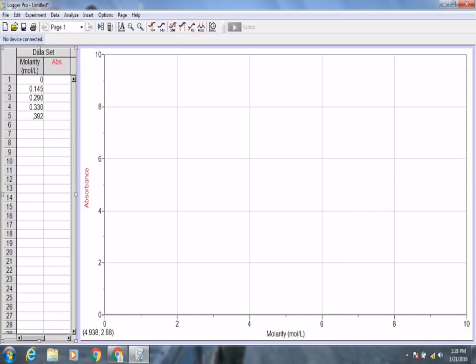So let's go ahead and throw in some absorbances here. Now these are just totally made up. What would the absorbance of water be? 0. Very good. Well, we'll start with that. My keyboard doesn't work. Did it go? There it goes. Let's see. Just making things up as we go. How about, what was the absorbance? Was it like 0.14? What was that one sample? 0.168. Okay. Remember 5?